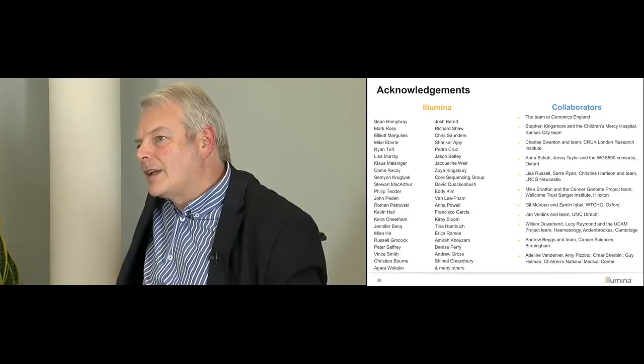Downstream as well, I think I've mentioned the ongoing process to resolve the data management challenges: shrinking to a portable genome, scaling up cloud-based infrastructure, deciding whether this is going to be in a public cloud or private, which substantially changes where you have to invest your infrastructure effort. And of course, the entire process of interpretation.